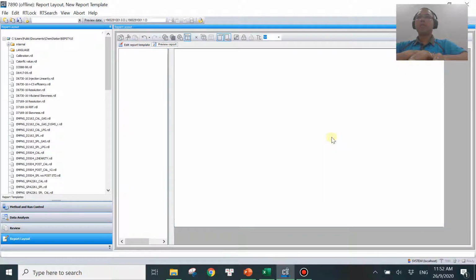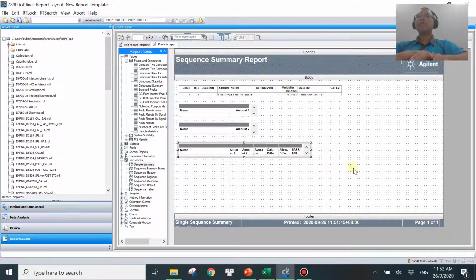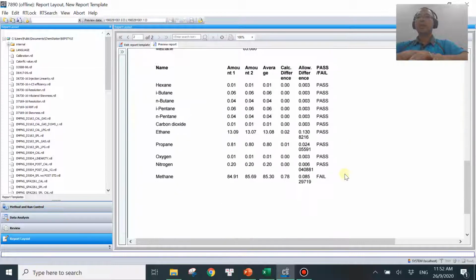Okay, view. Okay, yeah, there you go. So everything passes. It's just the last one is failed. Doesn't matter, but as long as the calculation is correct, we are good. Then the last step we just want to do is perform the conditional formatting for all of this.